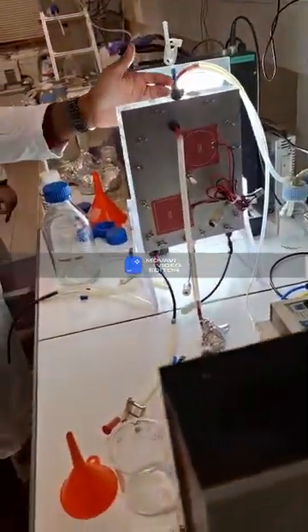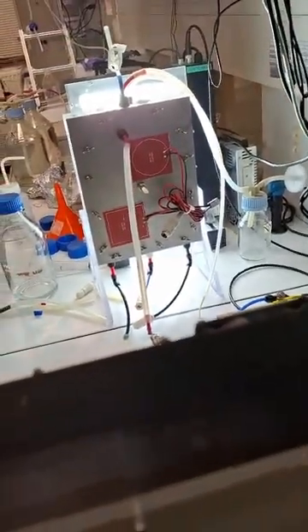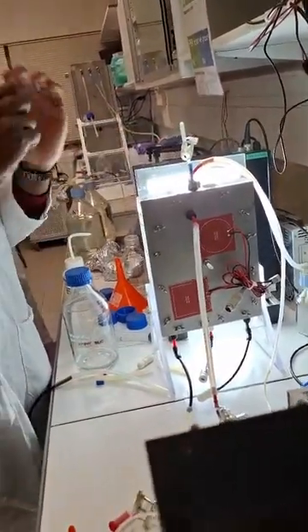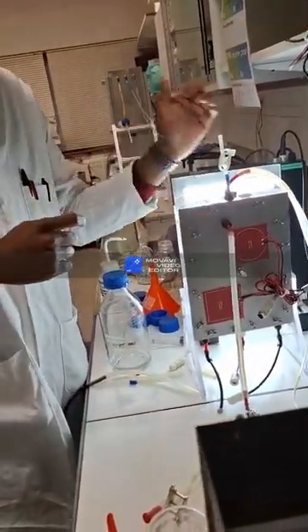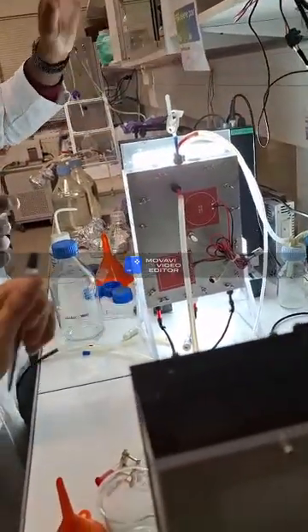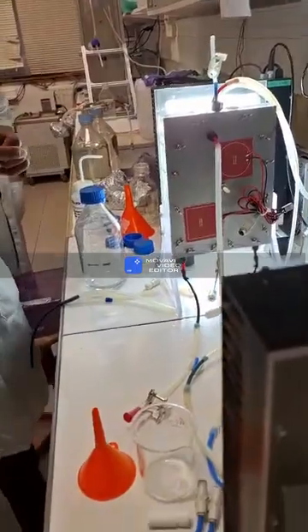And sometimes if you plug directly something like this, you need a vent, just to push out the excess air, because you always need a vent. Oh, this is a filter. Yes, this is like a filter.